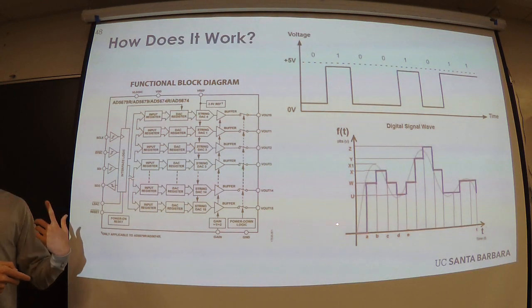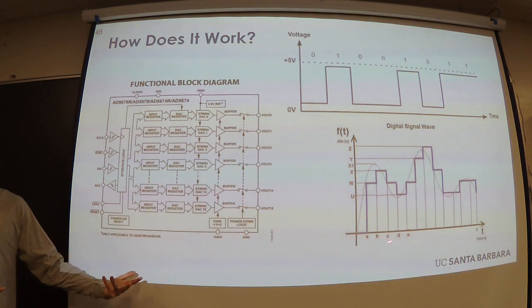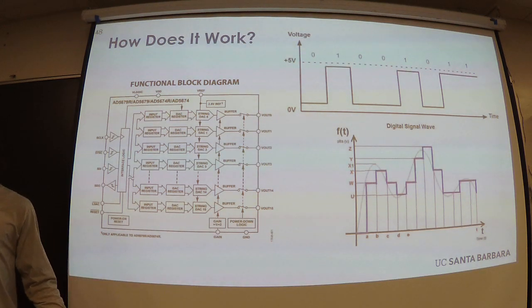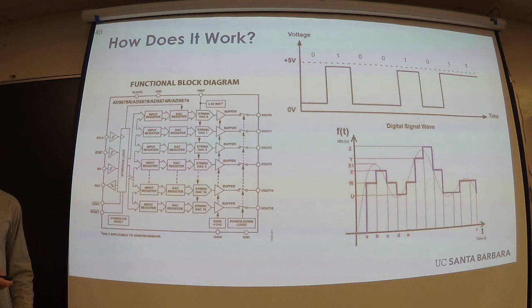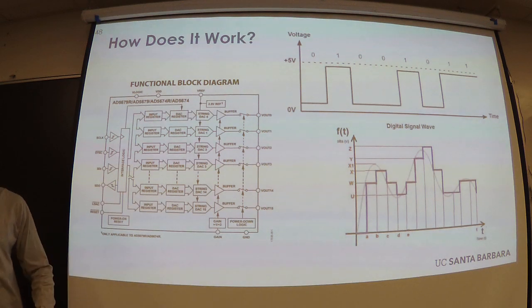And so if you change your output voltage by sending these commands very rapidly, you can reconstruct an analog signal by saying, okay, at time one, I'm going to output this voltage here, and at time two, I'm going to output this voltage here, and so on, and you can reconstruct this arbitrary analog wave. Now, implementing that in code would be very difficult, so fortunately for me, the signals that we want to construct at the end of this are just square waves, because in the literature, that's what produces the response from these cells. So all I really have to do is tell the digital to analog converter to output this voltage at this time and output another voltage at another time and oscillate back and forth between them.